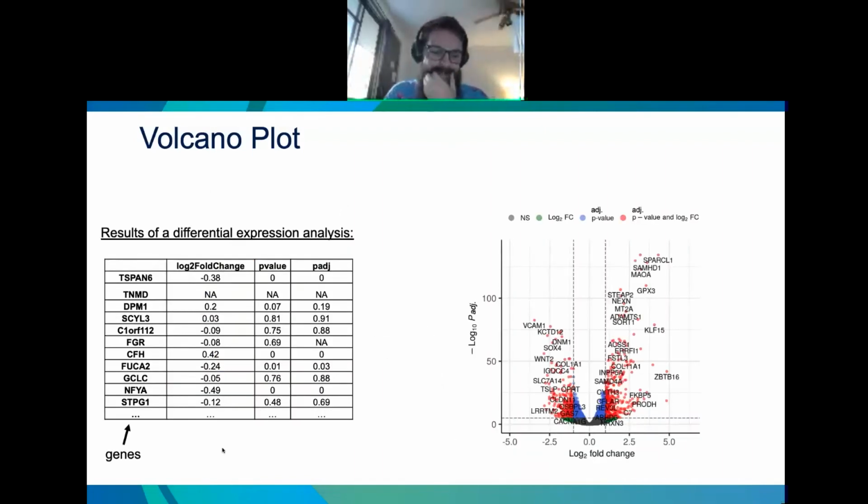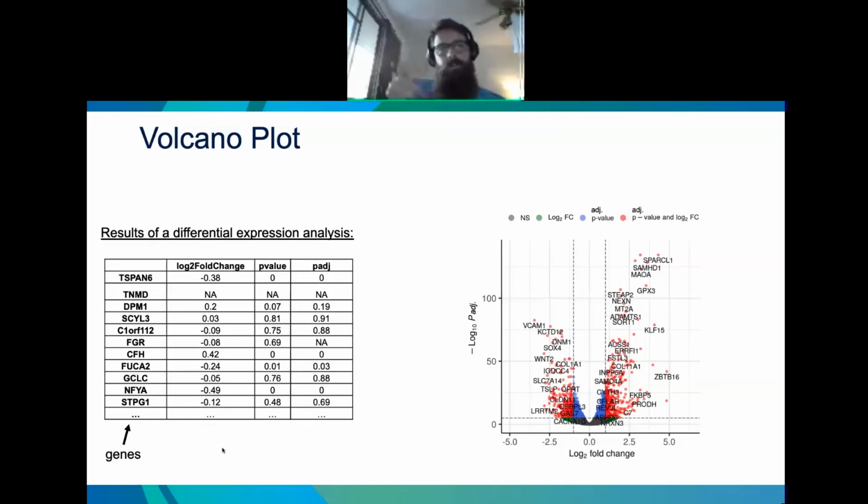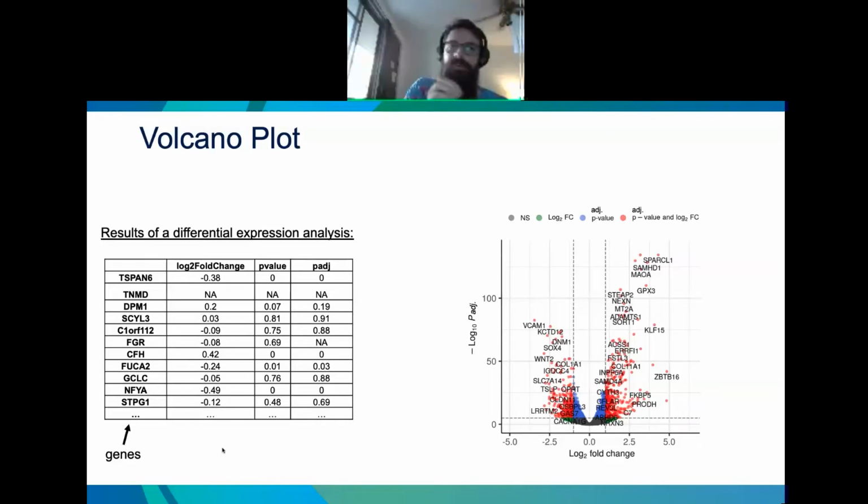Yeah, that's true. I just want to only see the genes that I think are significant based on passing the adjusted p-value cutoff. We offer the option to do that, and we will do that when we're personally looking at it. But generally, for most publications, we just present it as is, and sometimes we will color them as well. Yeah, okay, interesting.